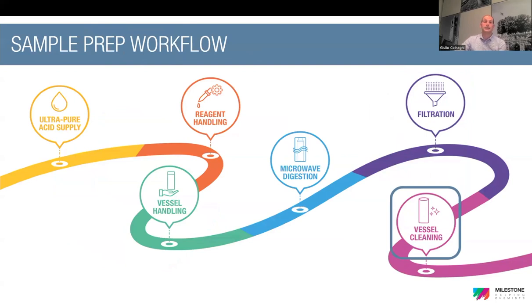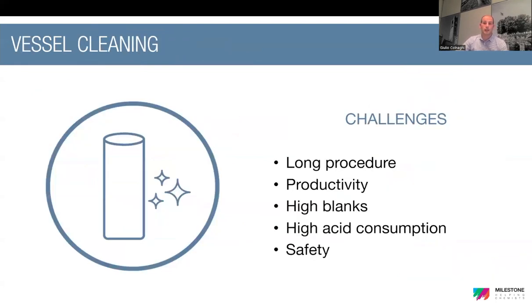The last step that can be optimized is the vessel cleaning. And also here we have different options. When we consider this step, we need to consider that it is a tedious procedure and takes a lot of time. Often it is done in an acid bath or through a microwave digestion or extraction system. But it's key to consider that when you use the microwave unit to perform your cleaning cycles, you dramatically reduce the productivity. And if the cleaning is not done properly, you also face high blanks.